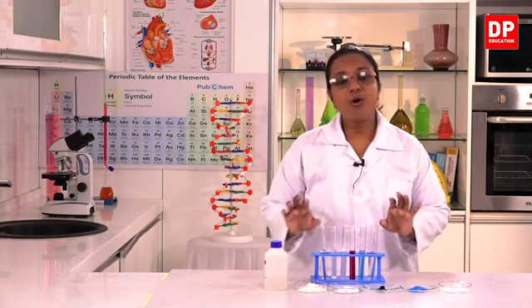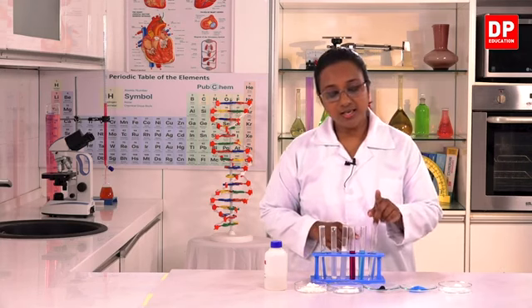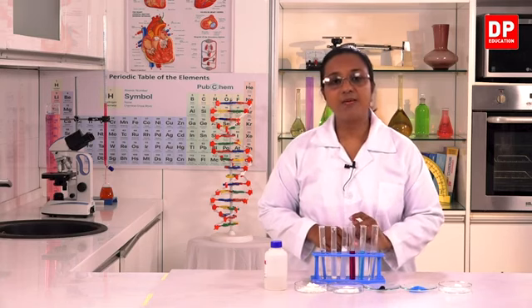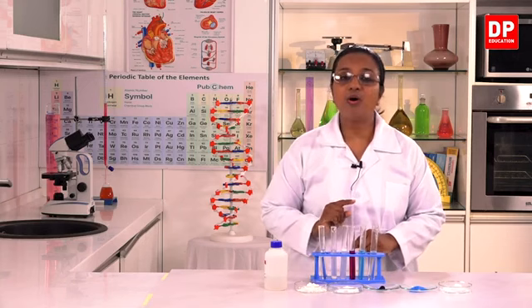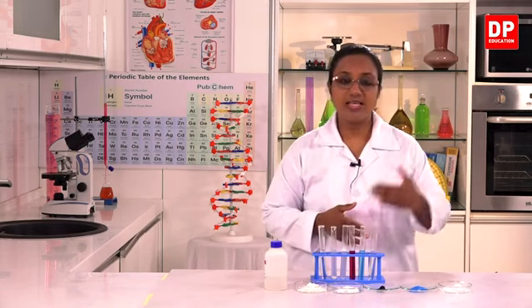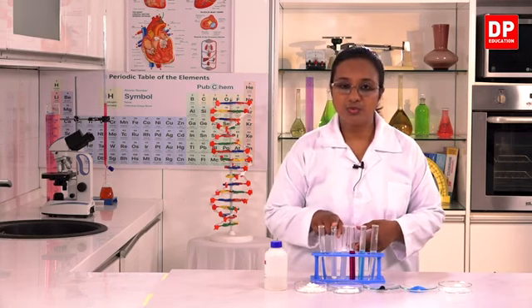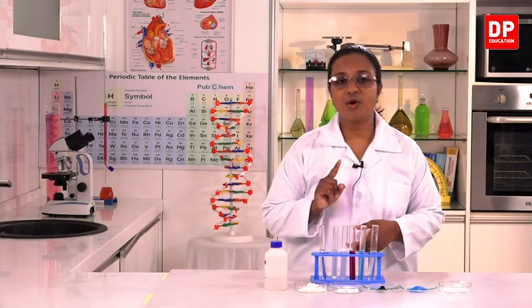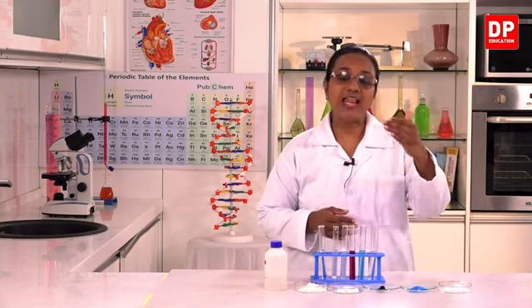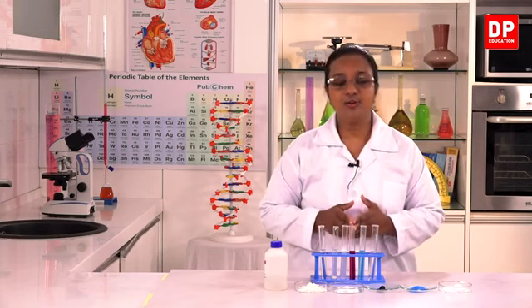So, if you look at all these solutions clearly, you can see the sodium chloride mixture, copper sulfate solution, potassium permanganate solution, and ethyl alcohol mixed with water. They all have uniform transparency and the color is also uniform. But if we take these two, that is the washing powder dissolved in water and wheat flour dissolved in water, the transparency and the amount of substance present throughout the mixture is not uniform.